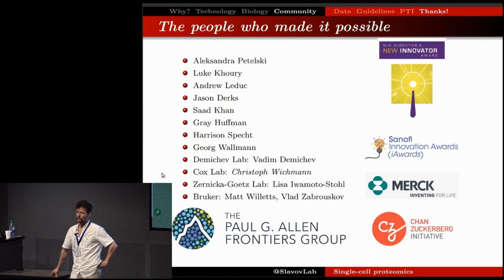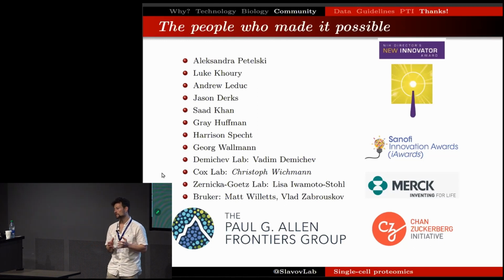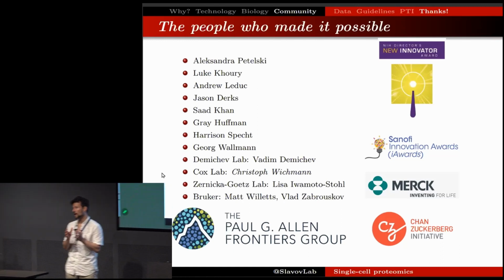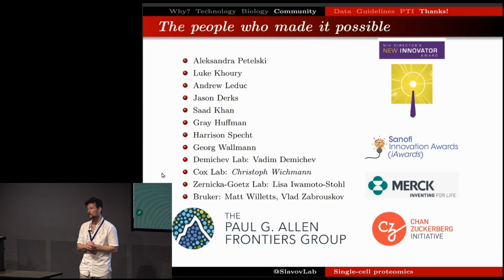And one of the strengths that we found of NPOP is that it's a very gentle method. So when we work with primary cells, especially primary cells that have undergone sample dissociation, the gentle handling was very helpful, even essential to getting data. But it does work. We have applied it to cells from a number of different tissues. Brain, not yet, but in principle, if we can dissociate neurons, that should work just as well.